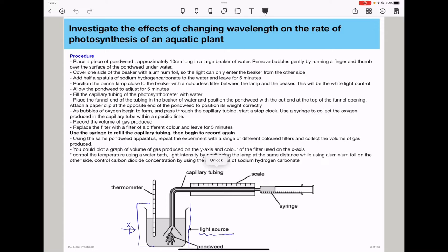You need to place a piece of pondweed approximately 10 cm long in a large beaker of water, and then remove bubbles gently by running a finger and thumb over the surface of the pondweed under water. This is to ensure that there are no bubbles of gas that are going to interfere with our experiment, and to ensure that any produced oxygen can leave the pondweed properly. You will cover one side of the beaker with aluminum foil so that the light can only enter the beaker from the other side, and add half a spatula of sodium hydrogen carbonate to the water and leave for 5 minutes.